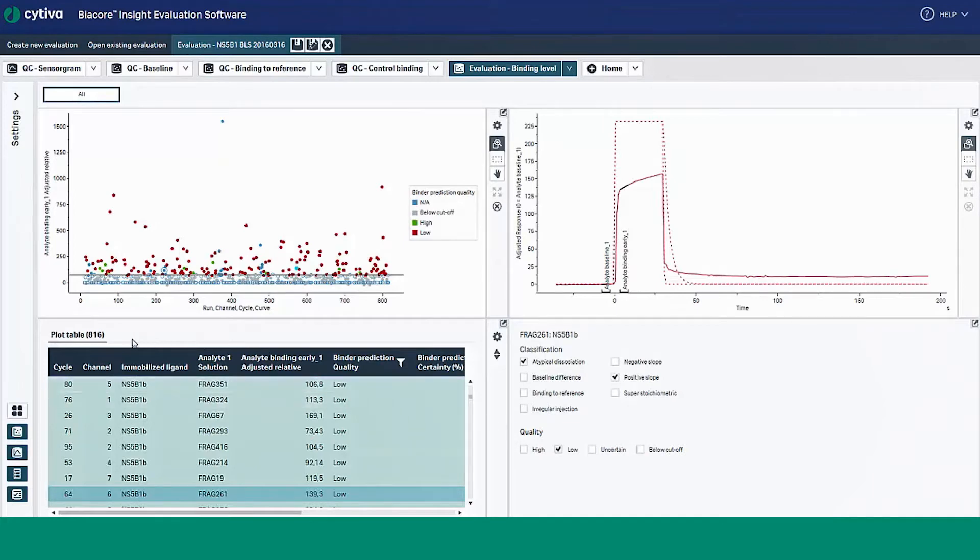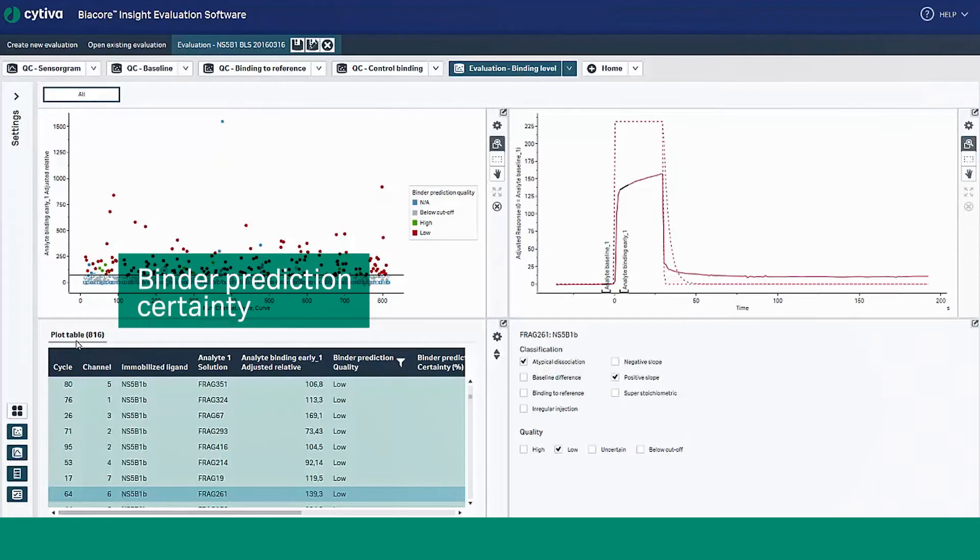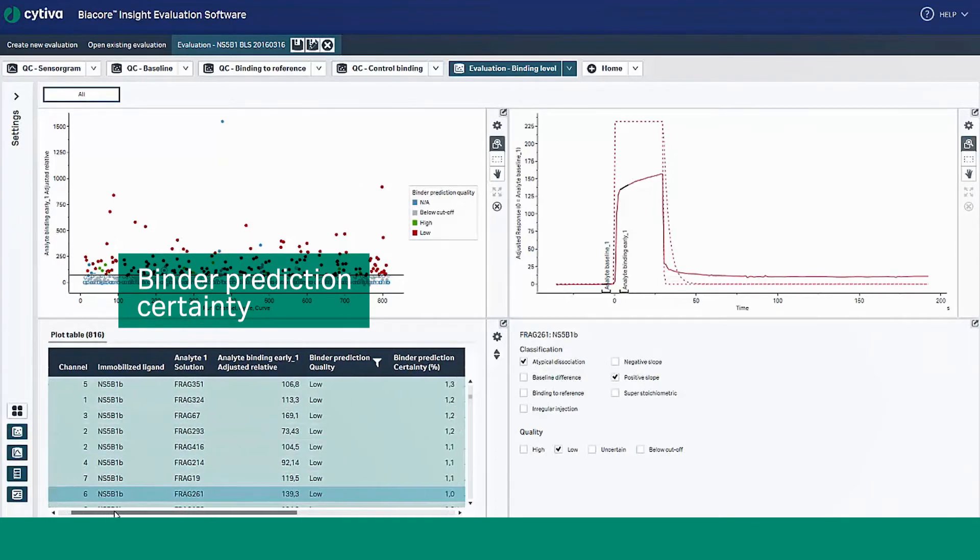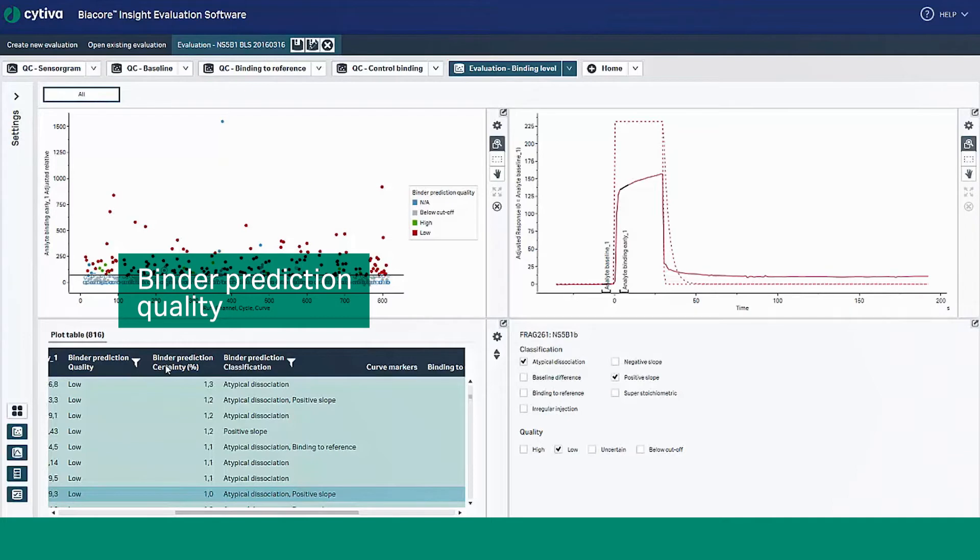Look at the plot table under the plot to see some other important information like binder prediction certainty. This is the percentage measure of how confident the model is in the prediction of binder prediction quality.